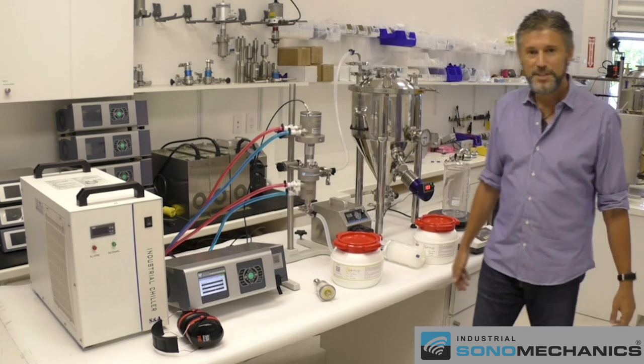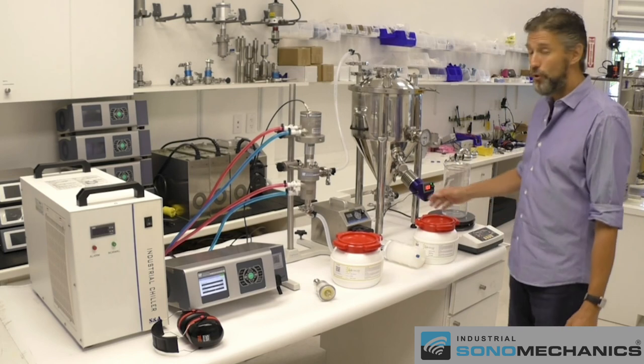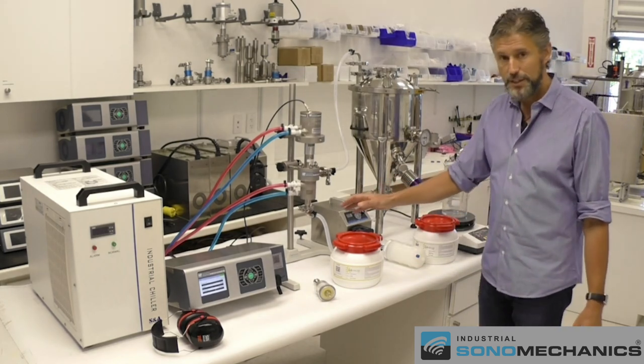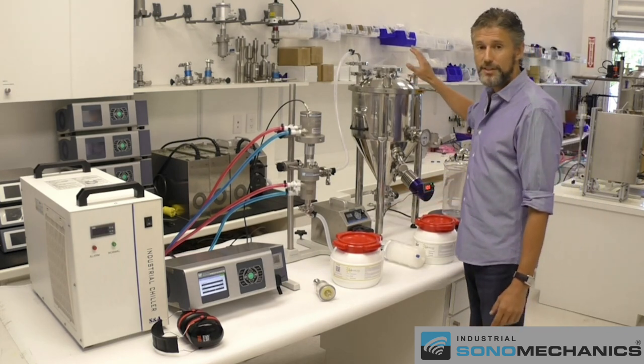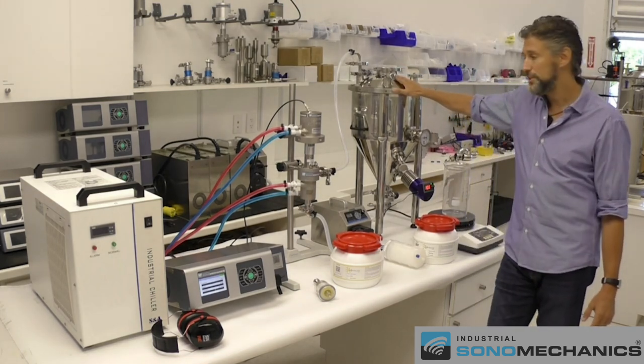This is the basic overview of how you would make translucent liquid nanoemulsions or powdered nanoemulsions using Nanostabilizer LT or Nanostabilizer LSO in combination with the turnkey bench-scale ultrasonic processor BSP-1200. Thanks for that overview, Alexey, and thank you everyone for watching. If you'd like to reach us, you can contact us through our website sonomechanics.com or email us at contact@sonomechanics.com. Have a great day.